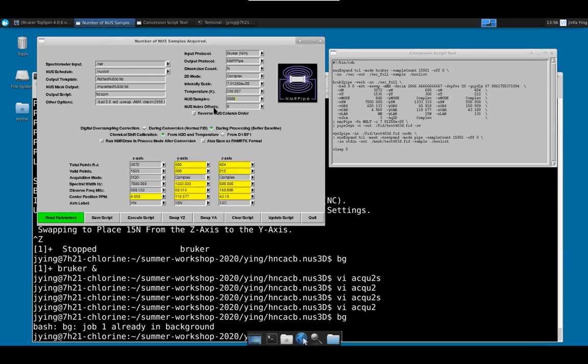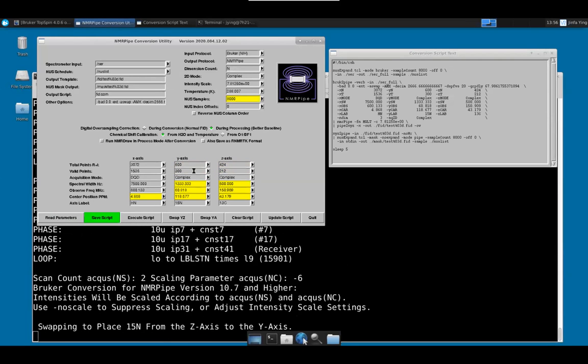You enter, and these entries become highlighted because it means that you have to click read the parameter again to update those two. The reason for that is that, remember this, okay, 212 and 300 data points, 300 and 212 here. If you, let's say, only have 100 data points, for example, and you read it again, you see that this has only become 297. This has become 209, right?